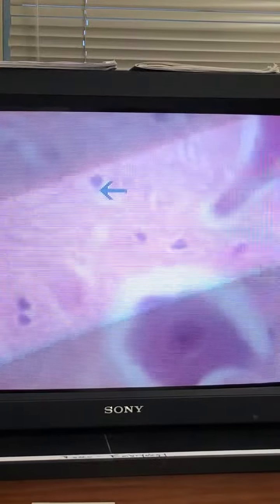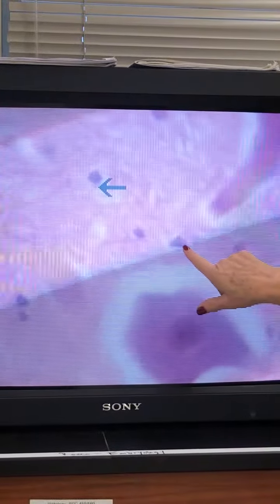So horn is the gray matter. Okay, and columns is like the white matter, essentially. But if I didn't have columns with it, then you have to know that, right? Okay. And so to just remind you about this, I know that you've got to go take your test. Okay, but we can sort of see these same types of cells.